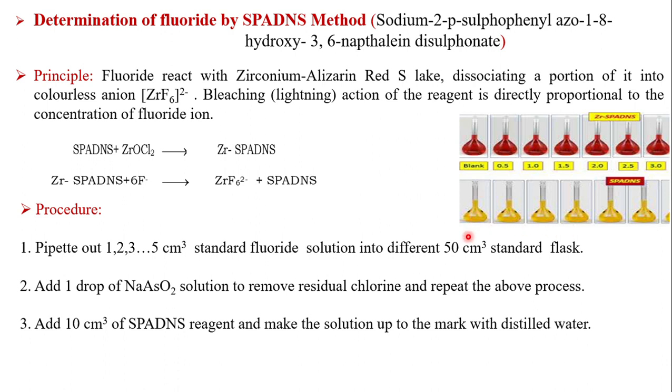We can measure the intensity of this. So this will give you the calibration curve like our colorimetry. Known concentration, known absorbance will produce a calibration. For example, take this as a sample. For the sample, we don't know the concentration. The same procedure should be followed.